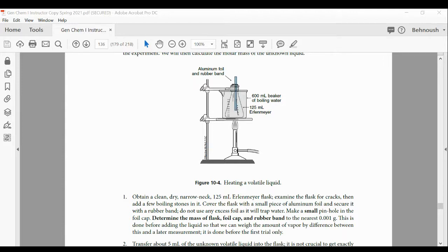There is the pinhole on the aluminum that covers the flask based on the setup. The only purpose of that pinhole is to make sure the pressure inside the flask equals the pressure outside the flask. So when your instructor provides the atmospheric pressure to you, it is going to be whatever it is. If the number is not in the video, you can use 760 millimeters of mercury. But if you find the exact number that day, you could use that.